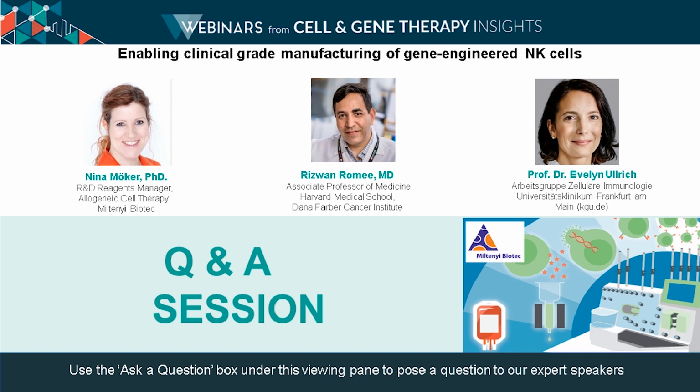And I think an important aspect is that this could be less costly and has been reported to show a very safe genomic integration profile, which could be an advantage.